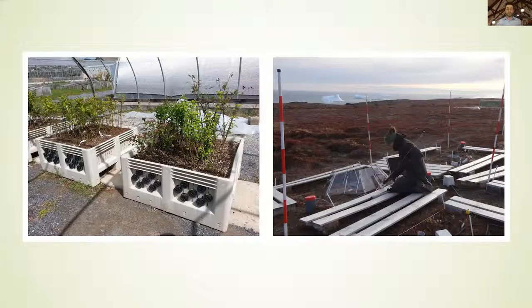So, just to give a good example, here we see tubes in a horizontal method. They have installed them right throughout the bed of these different boxes. You can take the scanner, place it in one tube, do your scans, pull it out, place the cap back in, and move the scanner to the next tube, and just keep doing that repeatedly, fairly rapidly, being able to get a full record, especially in that box, of all of these root systems for all the plants right there.